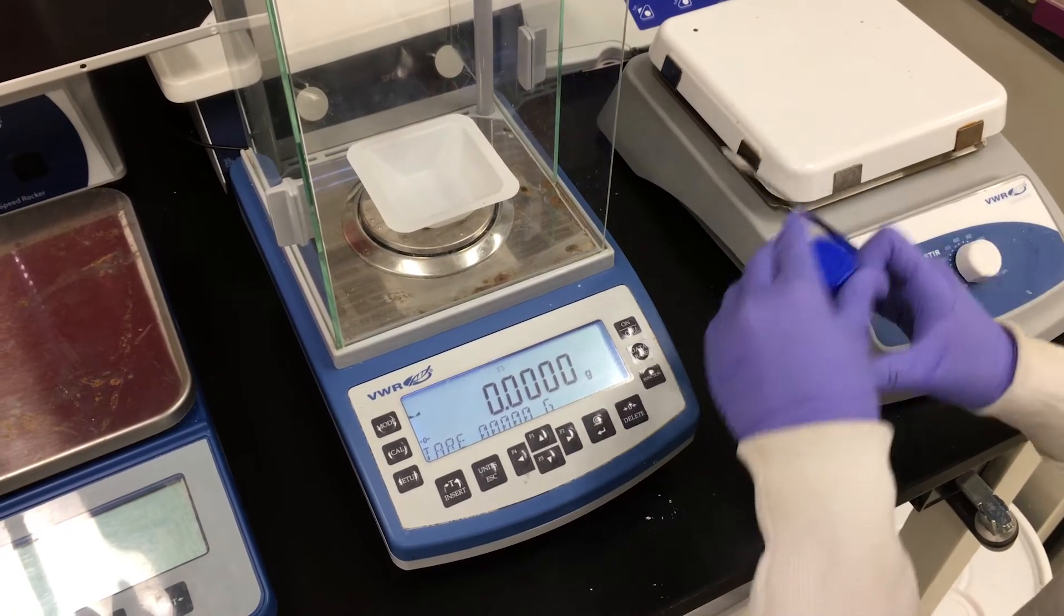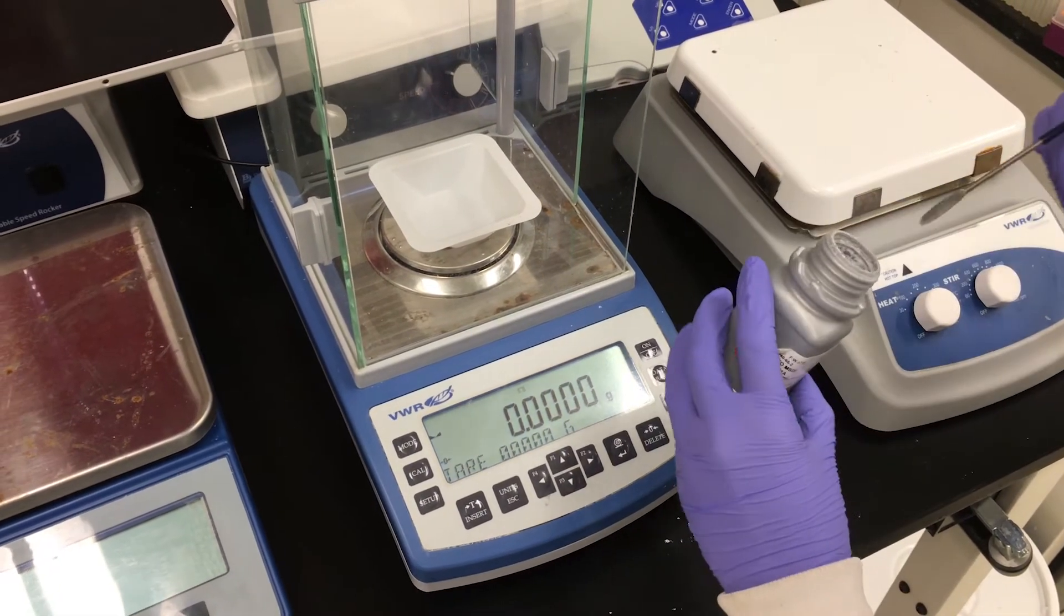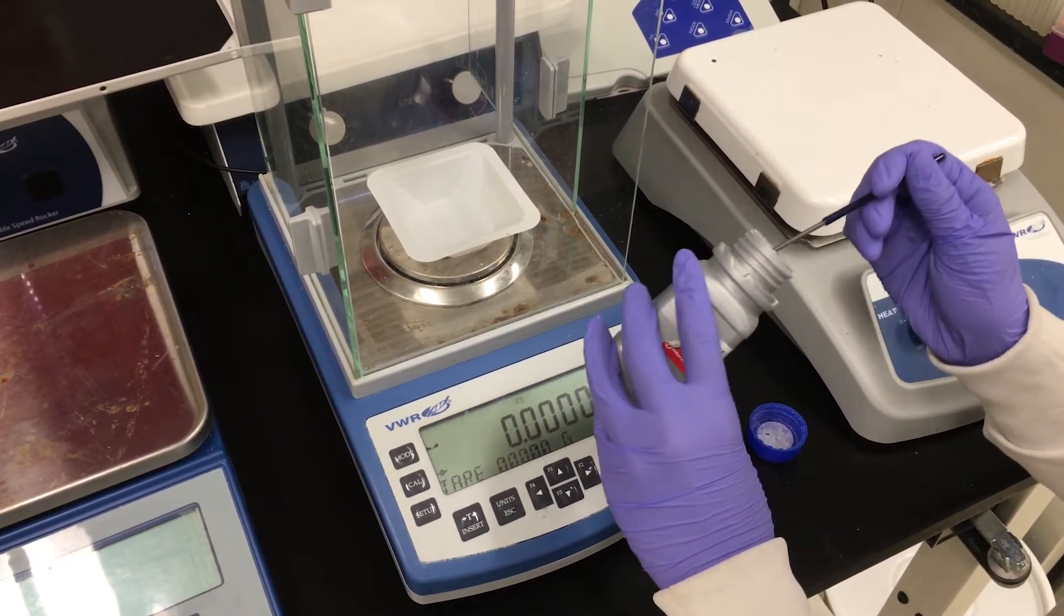Using a metal spatula, carefully weigh out sodium borohydride onto your weigh boat. Ensure that you do not spill any of this powder.